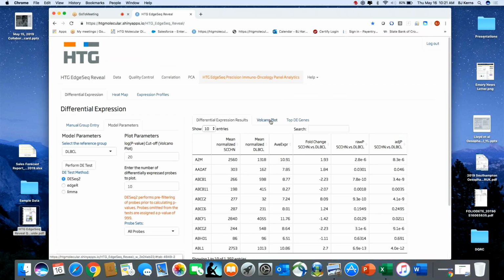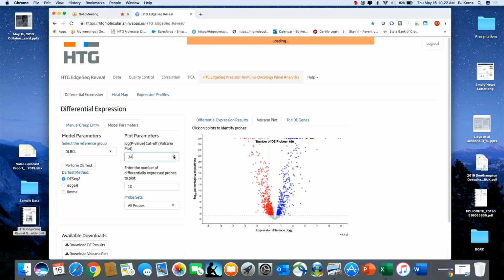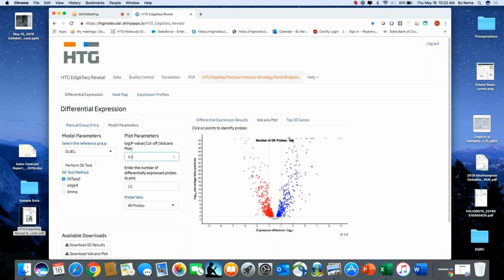The next thing we can do is a volcano plot. So again, nice pictures for publications and for posters. It is a way for you to visualize what are my up and down regulated genes. Let's do this one. I want to know what's happening on the top overexpressed genes. You can literally kind of pull this plateau down, right, off the plateau ridge, so that you can actually see where those genes are falling that are up and down regulated.